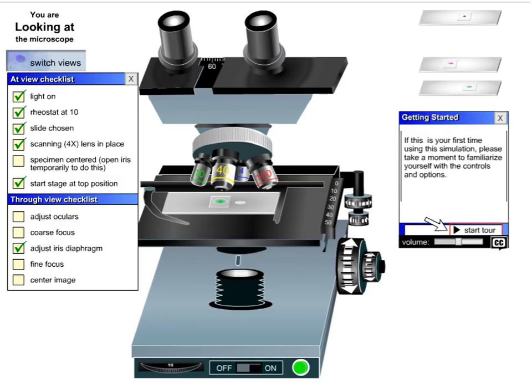The first link is going to take you to a slide, and right away there's going to be a robot voice. You can take the tour and it'll explain how to do everything. You just click on things — for example, you click from the off to the on button. This one here is the rheostat, which controls how much light is projected from the light emitter — more light or less light. And this is the diaphragm, which is like an f-stop on a camera. It's a hole that allows the light coming up from the bottom, and this hole can be made bigger or smaller.